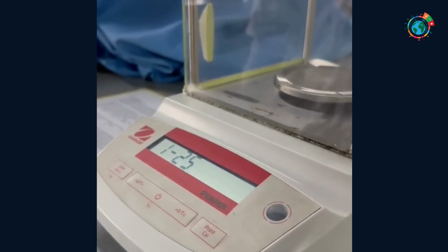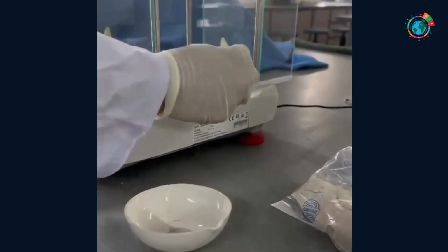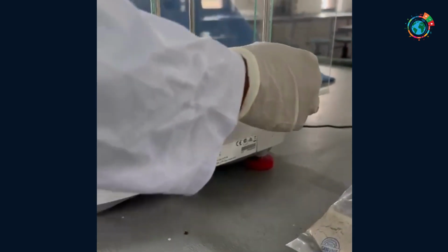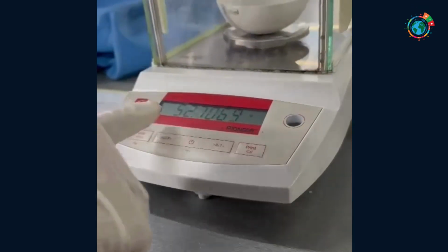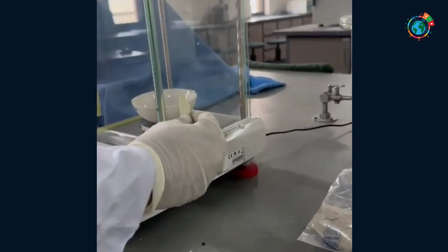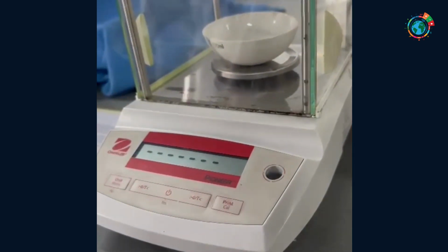For this, calibrate the electronic weighing balance to 0 by pressing the zeroing button. Then open the glass door by pushing the handle in the forward direction. Then gently place the clean and dry china dish on the balance pan. Carefully close the glass door after placing the empty china dish on the balance pan. Note the reading visible on the digital display. This reading will be noted as the weight of the empty china dish. After noting this weight, use the tare button to reset the displayed weight on the balance to 0.